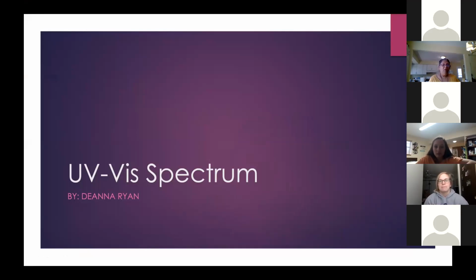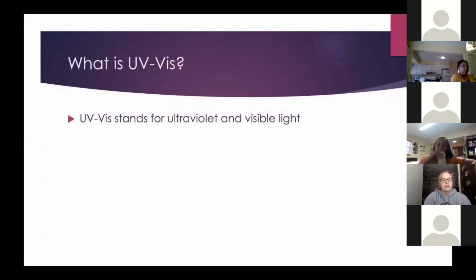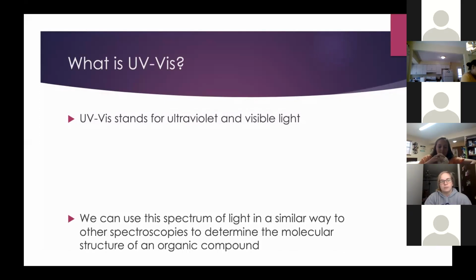So Deanna will talk about UV spectrum, and it's actually chapter 16 in the newest edition, sections 11 through 13. Okay. All right, Deanna. Okay, so as Dr. Mary said, I'm going to be presenting over UV-Vis spectrum. So what is UV-Vis? The UV part stands for ultraviolet, and then the Vis part stands for visible light.